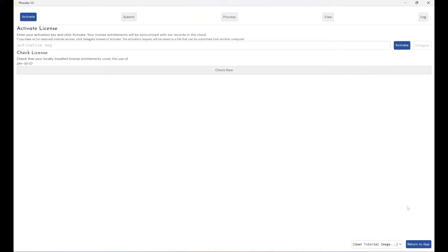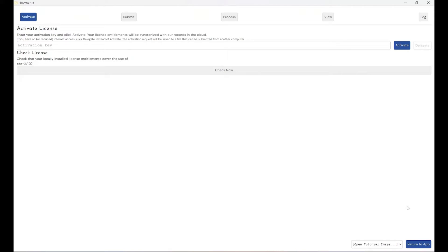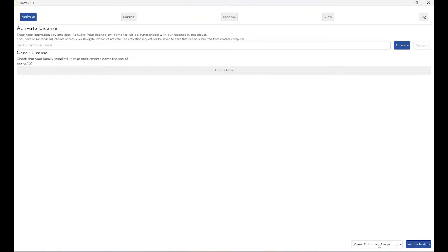So when you first download a copy of Phoretics 1D and try and open it, you're greeted with this screen. Now again, if you hadn't tried the software before and you wanted a free trial of the software, you can try it for free for seven days. However, if your seven days has run out, you won't have an activation key to put in here that is valid. However, if you come down to the bottom right hand corner of the software here, you can see you've got the option to open a tutorial image.